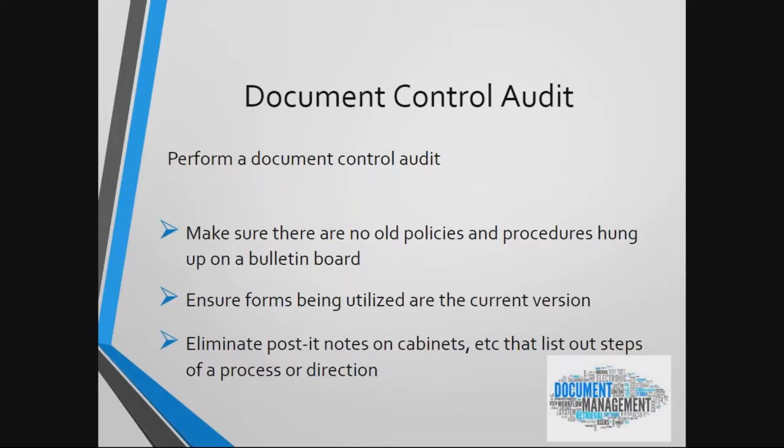As I perform a cursory review of forms the department is utilizing, I will do a check of the document control to ensure that they are using the correct version. Our document control system is electronic, so I am frequently encouraging the teams to eliminate files where they like to keep copies of forms and ask that they print the needed form from our document management system instead. So as they need that document, they're asked to print it so that we don't end up with a whole bunch of documents out there that aren't current because they didn't realize that there is a newer version.